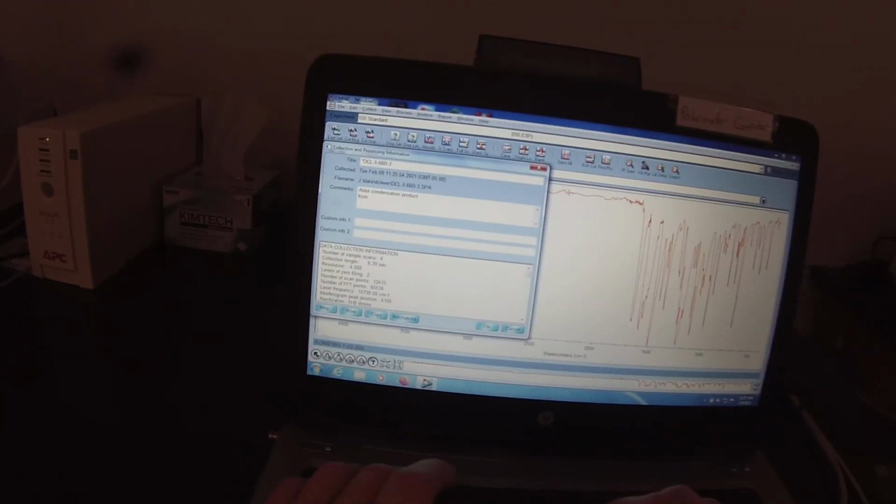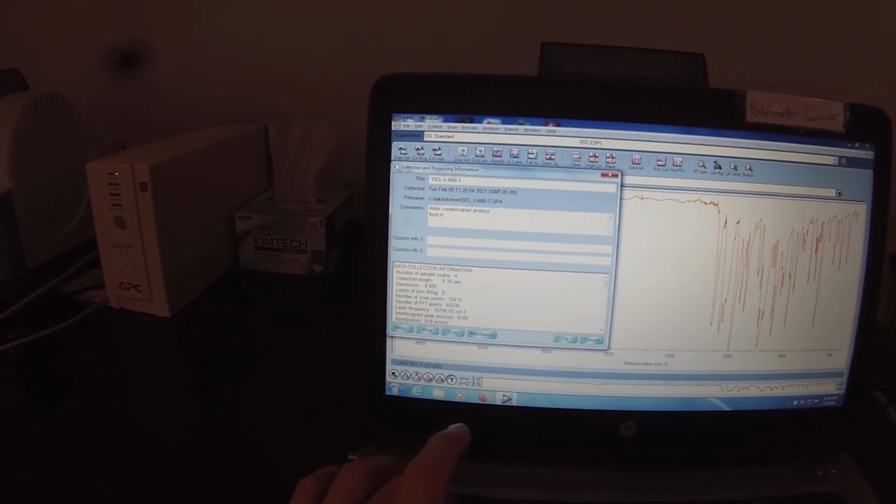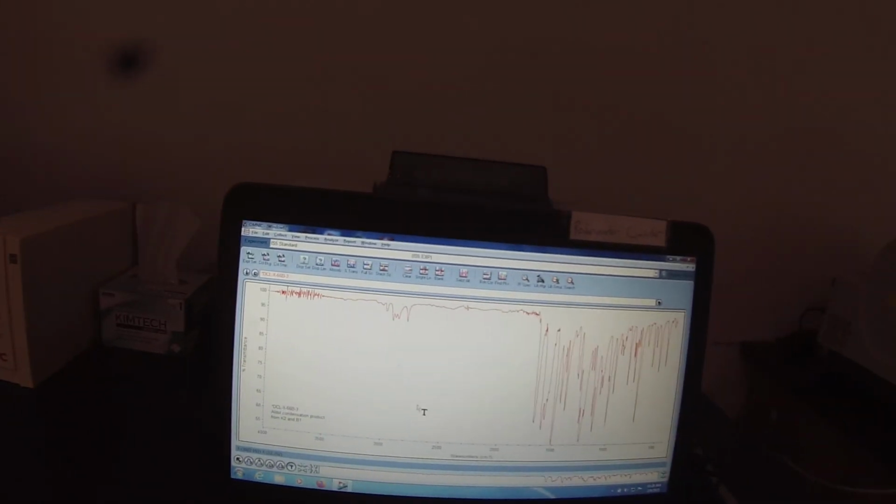From K2 and B1. Put that in the lower corner. When I do my fine peaks, I'm going to want to be able to see that peak, so I'm going to change my display limits from 52 to 46. That should give me enough room.